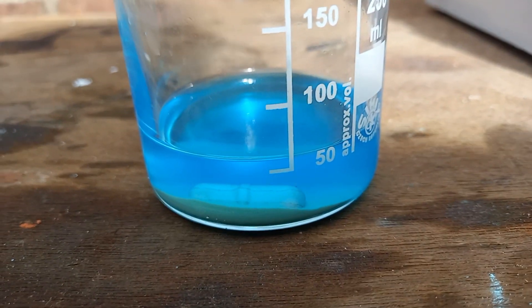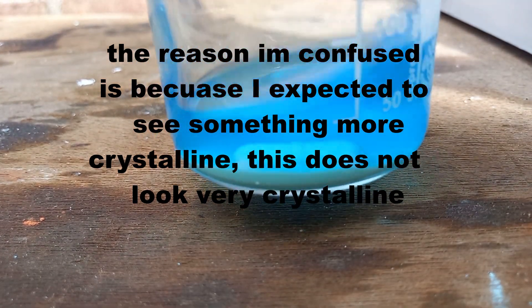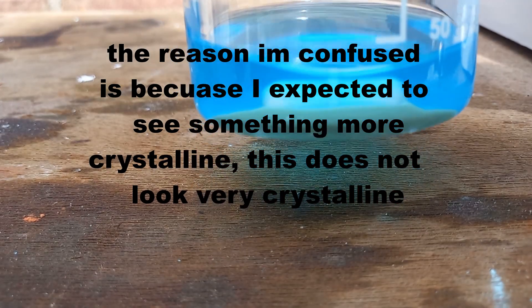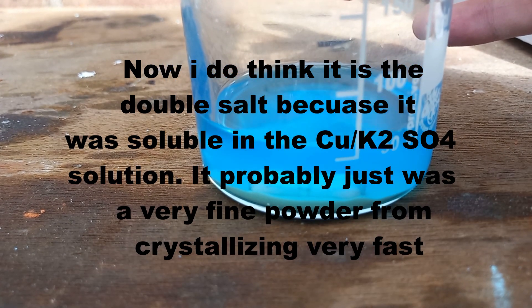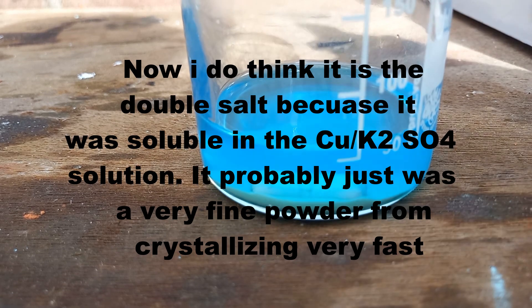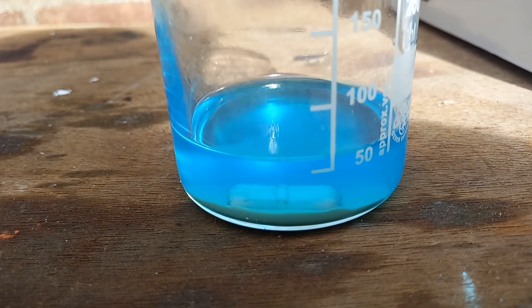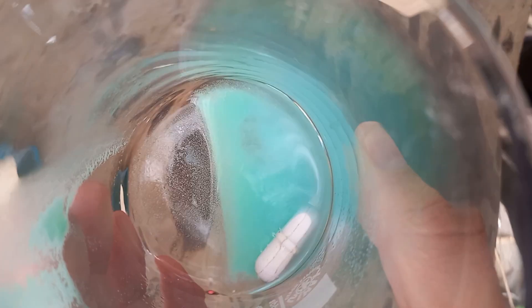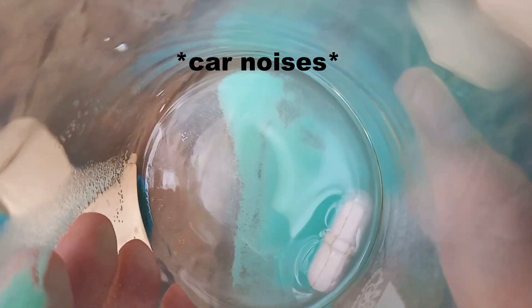So I don't know if that's my product — I don't think so. I don't think that's the right color. I really don't know what that could be, except maybe my product, but it doesn't look like my product. So I'm just going to filter it and see if I can get just the blue crystals I expected and not this weird other stuff. Maybe it's just because it's so finely divided it has a weird color. I genuinely don't know.